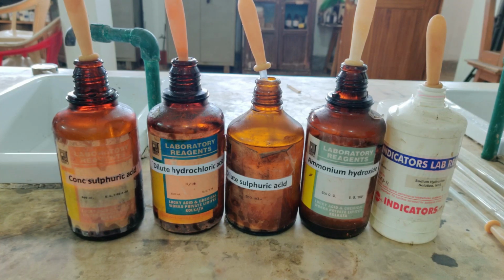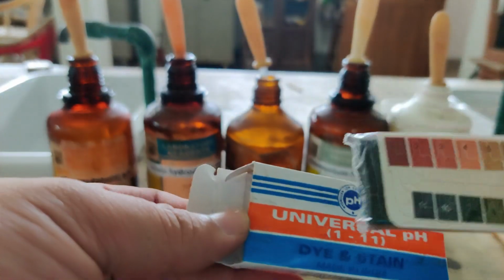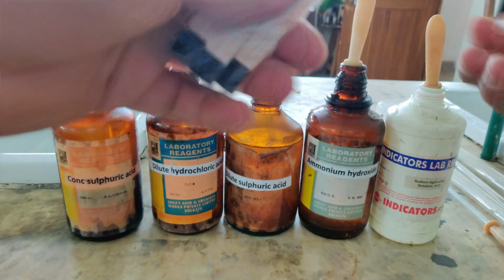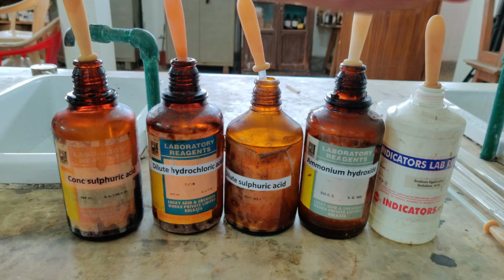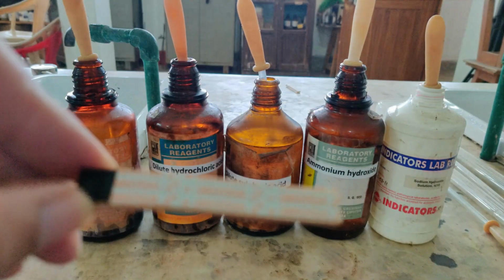Here is the cover of your universal indicator. I had already taken out this one. So here is the indicator, you can see. These are the strips of paper. Let me peel it off. I am going to use one of the booklets. So here it is. You can see this is a universal indicator.